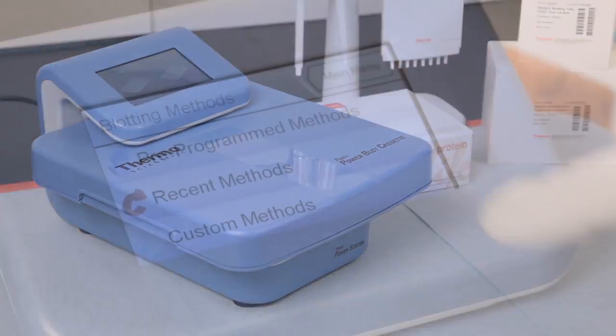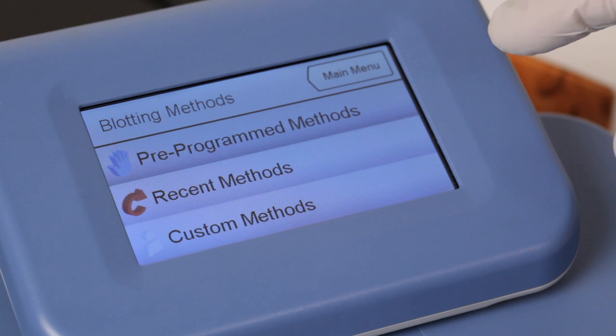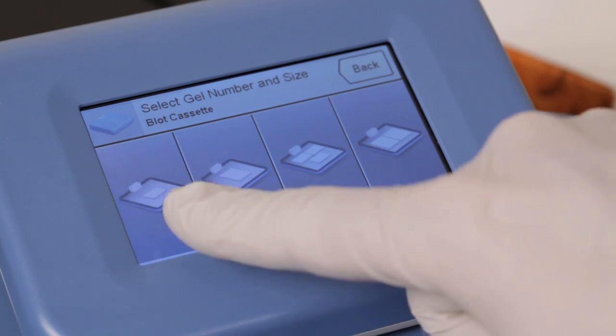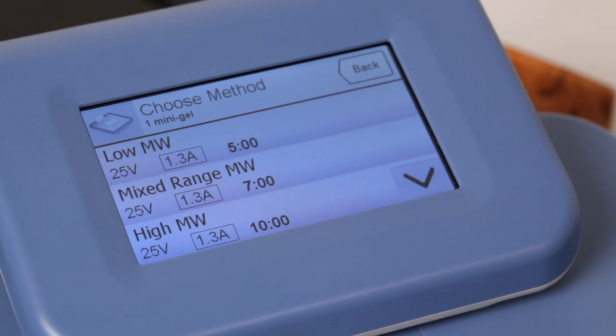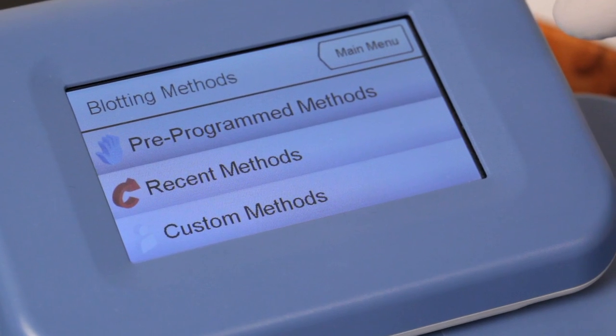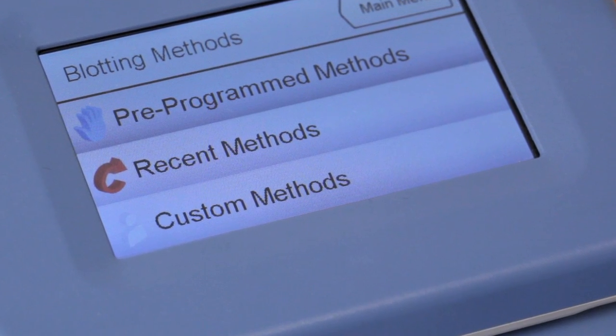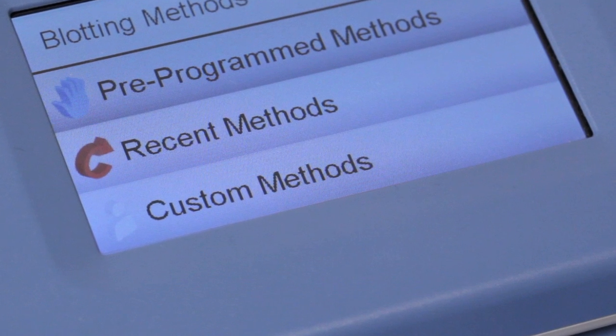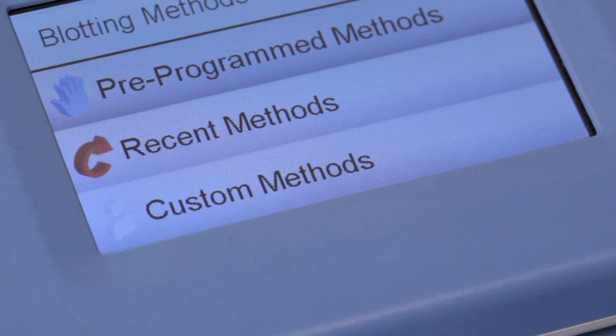The blotter comes with pre-programmed transfer methods that are based on the number of gels being transferred and the molecular weight range of your proteins of interest. These methods can be easily modified and saved, and custom methods can also be created. Recent methods are accessed from the main menu to quickly begin commonly used transfer methods.